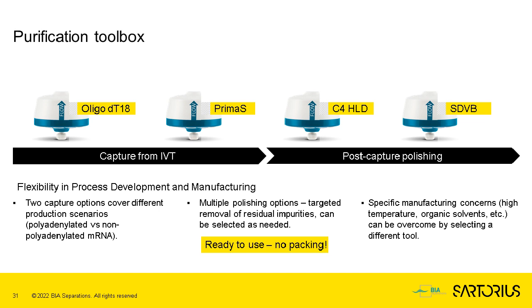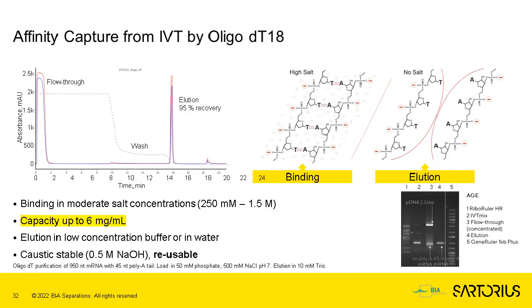So I would like to fast forward, in fact, to your questions. So allow me just to finish off with 2 or 3 thoughts based on the purification of things that we've been learning over the course of the past year or so, namely that affinity purification by oligo-DT is not only scalable, and we've been working hard on increasing the capacity of oligo-DT for purification of polyadenylated mRNA.